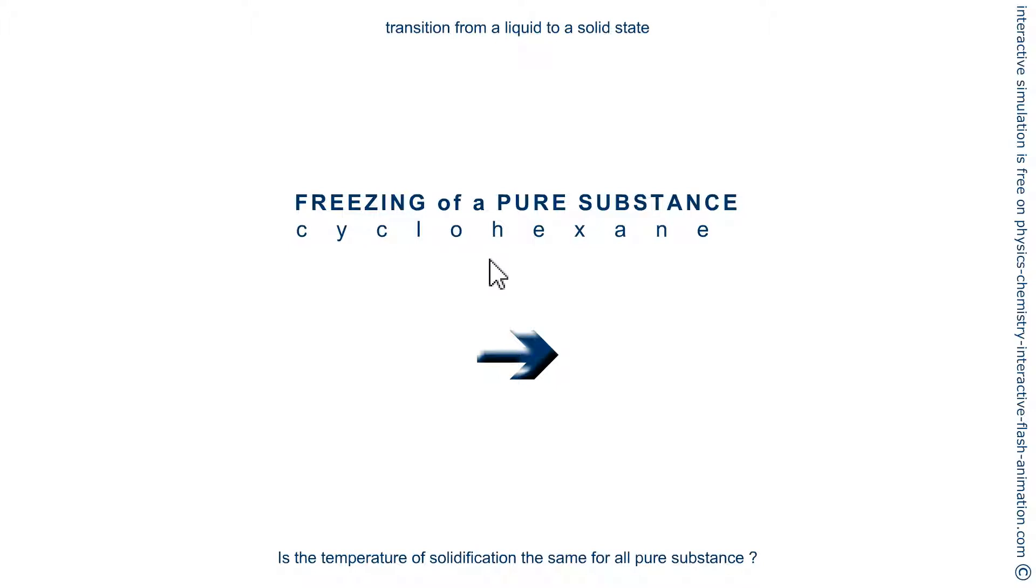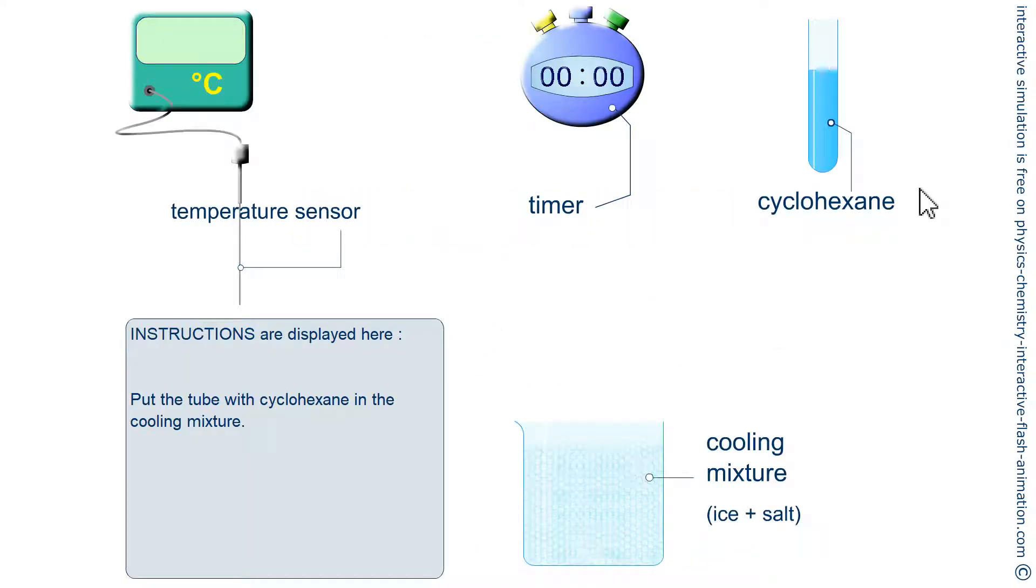To find out, we will focus on the solidification of cyclohexane. There is some in this test tube that we put in the cooling mixture: crushed ice and salt.